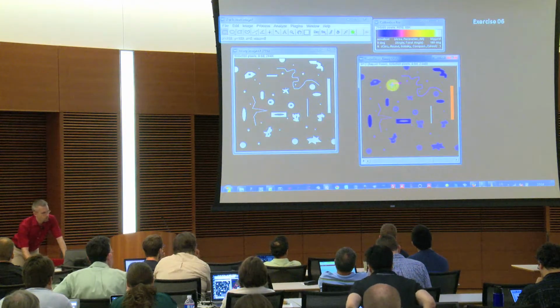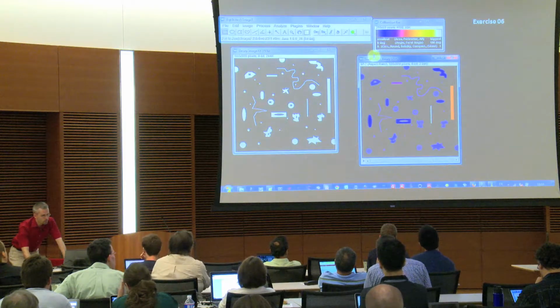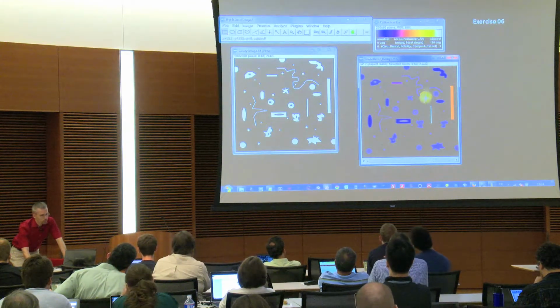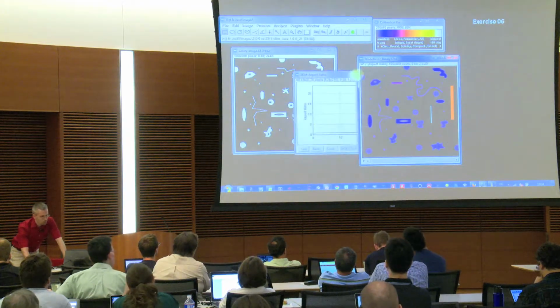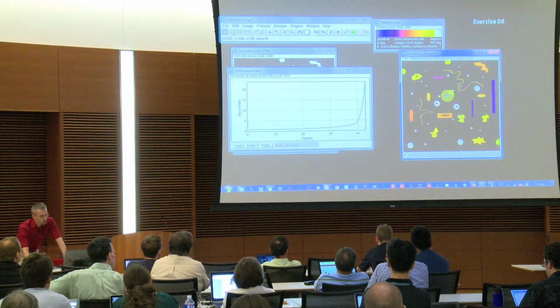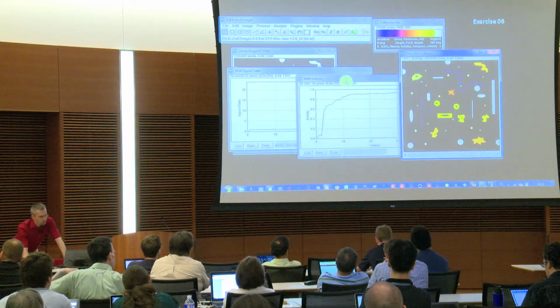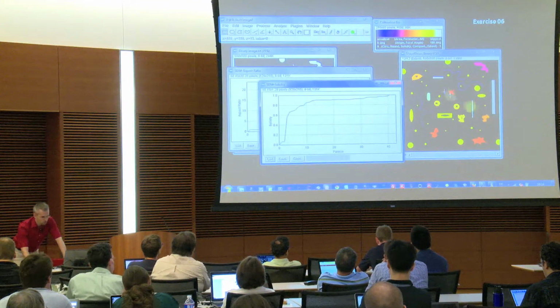If we, for example, want to get only those rectangular ones, in the aspect ratio part they have a higher value than the other ones. So if I click, mostly a little bit longer, inside, then I'll get a plot. And I can do that for other ones as well. So I can go here, for example, to solidity, click inside, get the plot for solidity, and potentially for extent.